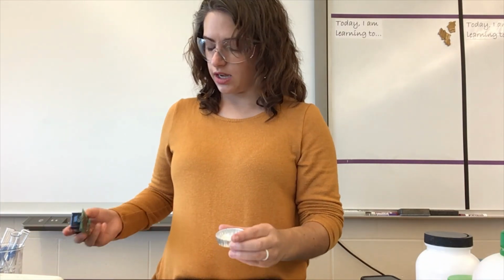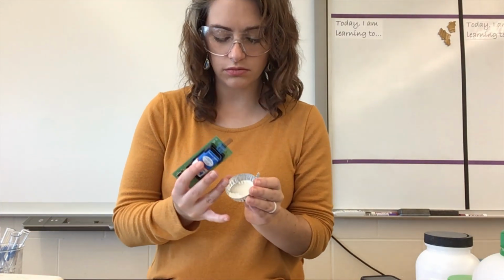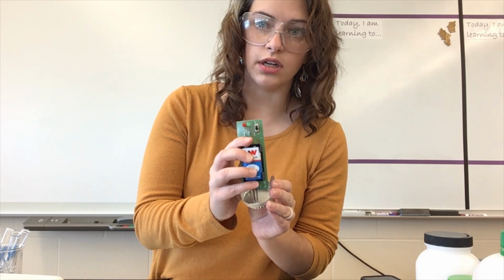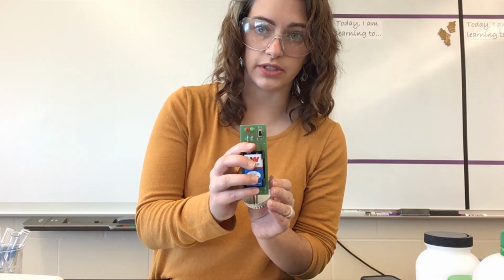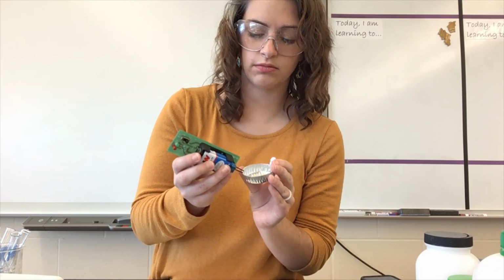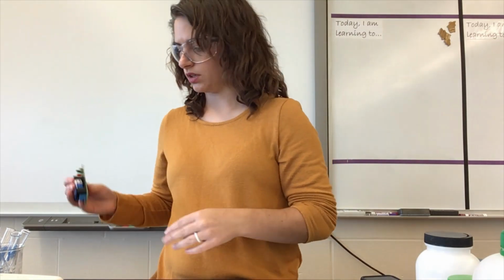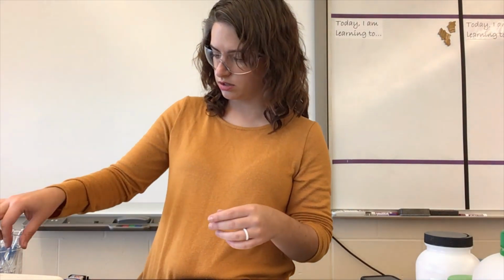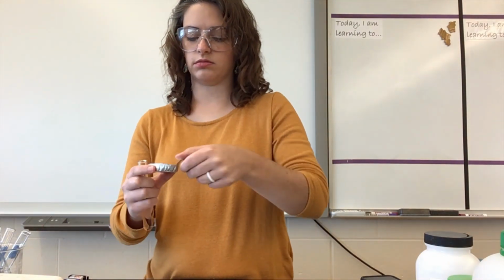Okay, conductivity. Not conductive as a solid. Okay, and then we're going to test our solution. There it is.